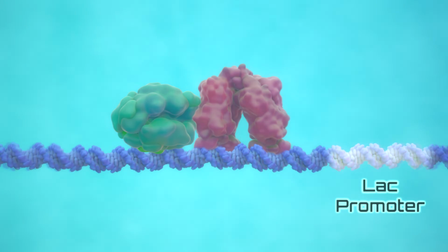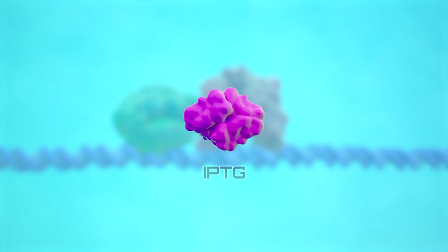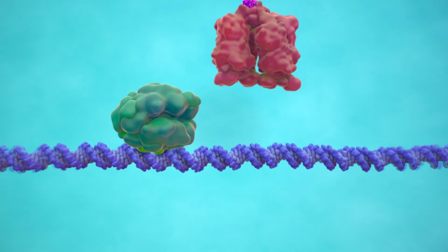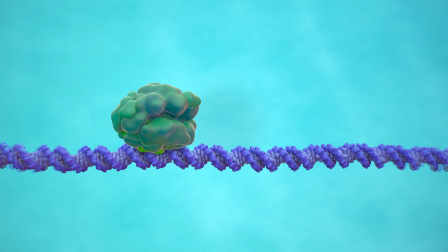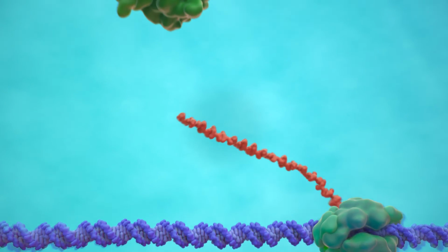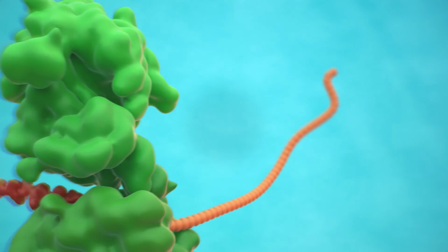At the right time, we'll add a chemical called IPTG to the media. IPTG, which is structurally similar to lactose, removes the repressor protein, which then allows the T7 RNA polymerase to do its job. As a result, the target gene DNA is transcribed into mRNA. This ultimately results in production of insulin.